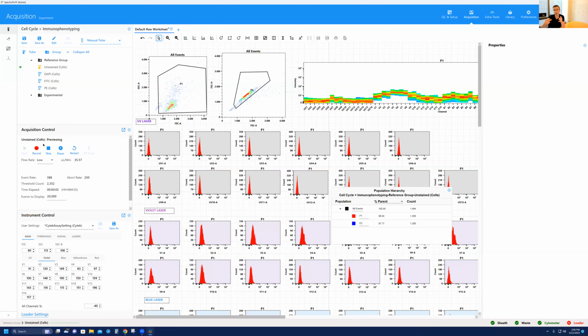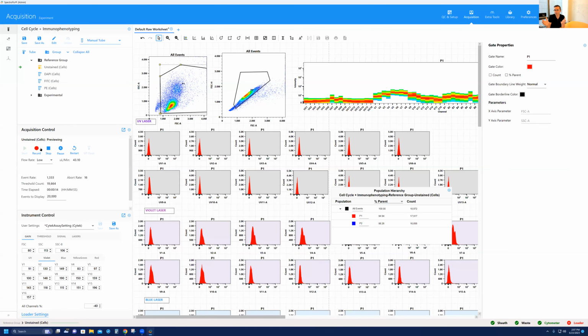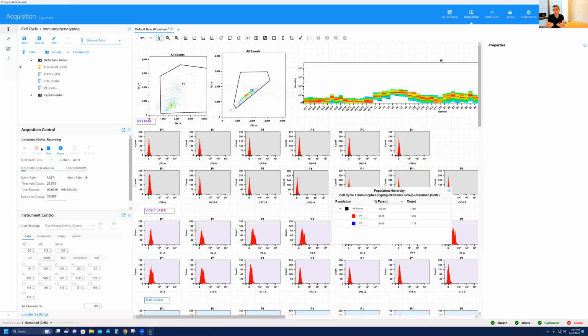So here, when we're acquiring, we really just want to acquire the data, and then we'll do the analysis afterwards, offline or on a laptop. Right here, we want to be less conservative so that we can see everything, and then we adjust all the settings appropriately so that we acquire everything appropriately, right? But the gating itself, we can worry about that later during analysis.